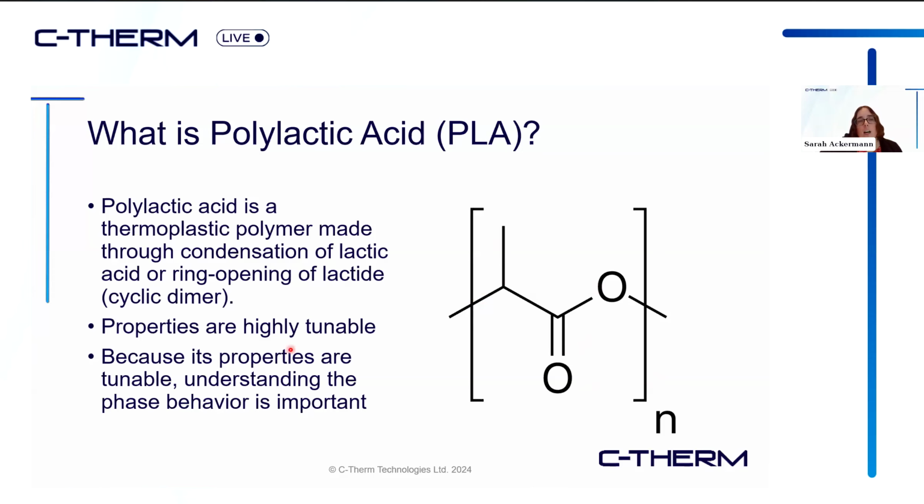The properties of PLA are highly tunable, just by tuning things like degree of cross-linking and the chain lengths. You can tune its mechanical properties, but that can be kind of a double-sided coin, because since its properties are so tunable, you really need to understand the specific batch and grade of PLA that you're working with, and understand its phase behavior, because you can't necessarily take a book value and use it as what the sample is going to behave like.